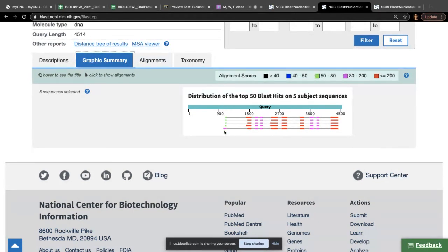And this last one, it's probably the other species. Let's see. Yeah, that's the Pongo. This one is not human, so I could actually not even have checked that. I was just curious to see if this other organism would have an mRNA that matches human genomic sequence.